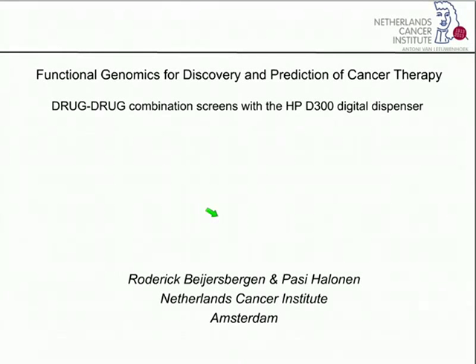Okay, so today we'd like to discuss our experience with using the HP D300 Digital Dispenser in our work for drug-drug combination screens. The focus of our research is really in using functional genomic technologies to identify and predict effective combination cancer therapies. Today we'll highlight a few examples of how we're trying to identify effective treatment combinations, and at the same time illustrate this with the use of the digital dispenser in our high throughput work.